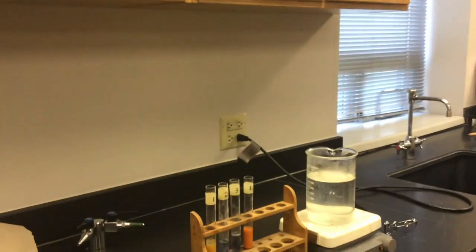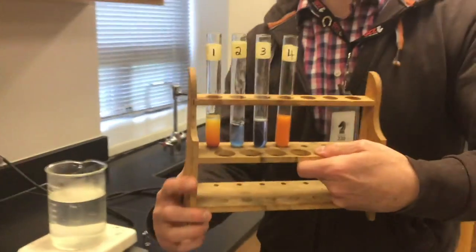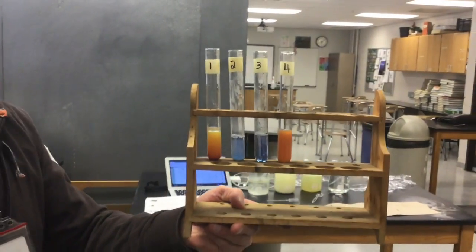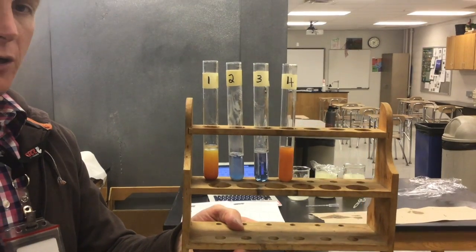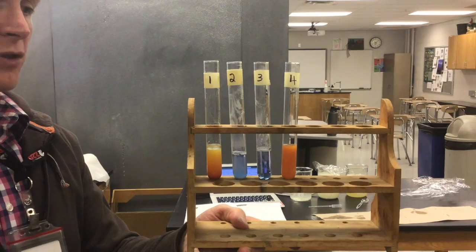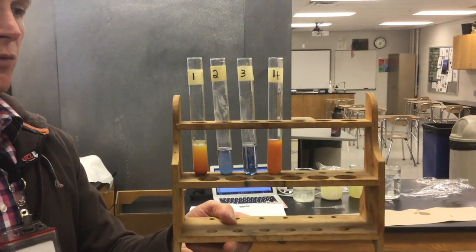And then finally, our last test, the Benedict's test. This tests for carbohydrates as well, but simple carbs, namely sugars, which are just not long chain. And we can see that when you see an orangish color, that tests positive for sugars, and that if you don't see orange, that would test negative for sugars. So go ahead and record your data for this one as well.